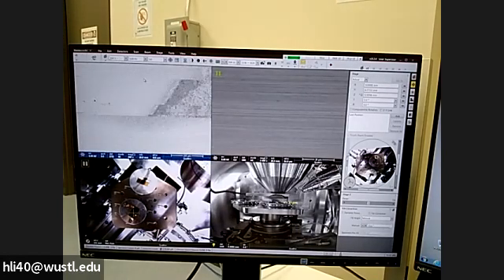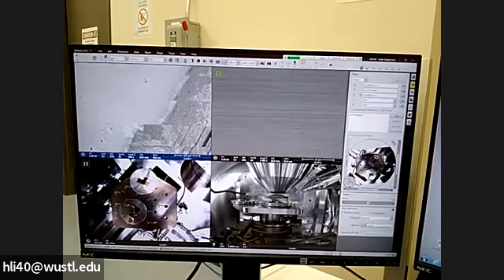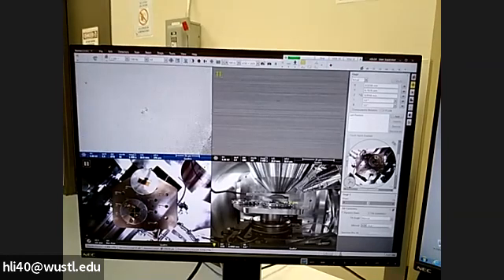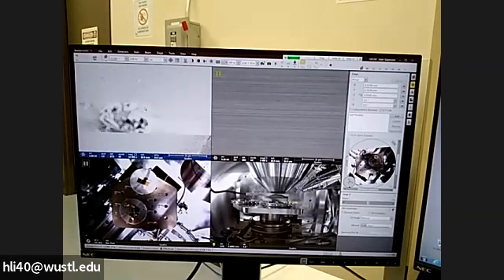That's very ridiculous. We need to compare this. It's supposed to adjust a little bit, but not too much. What I see here is when we change the focus, the magnification changes too much. It's not supposed to behave in that way. Yes, it will change a little bit. So now we found a target.